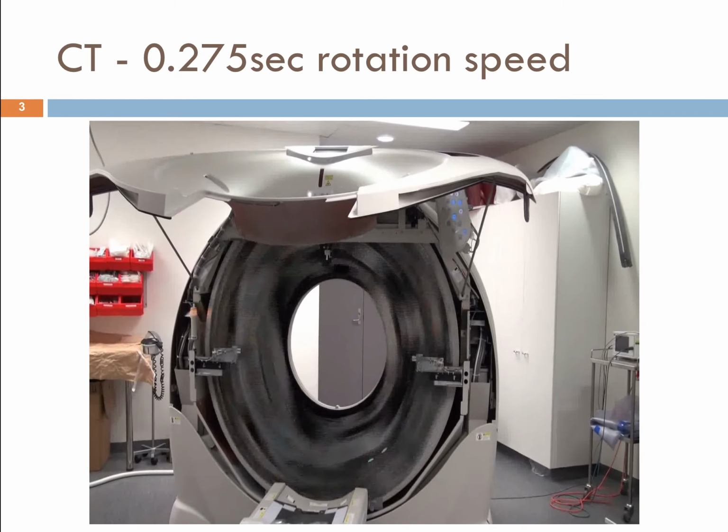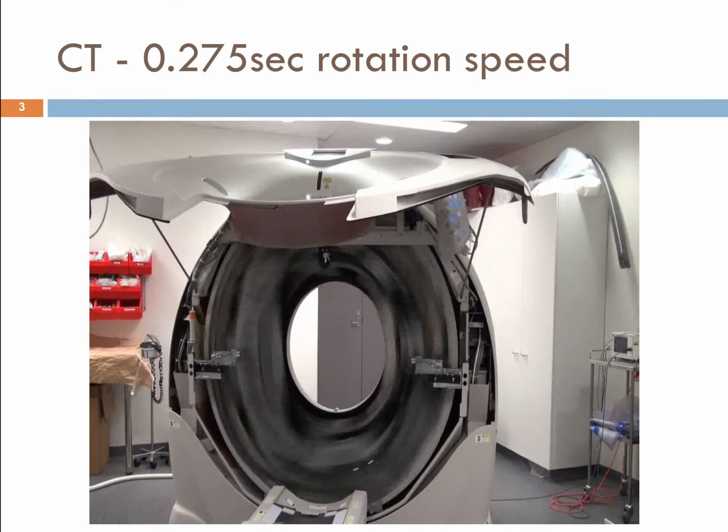Depending on how fast it rotates, it can generate around about 30 Gs of force. So these are generating enormous amounts of force, and I know you can't appreciate it from the image here, but they're quite noisy. There's a piece of paper at the bottom that's on the table. Luckily it didn't get sucked into the machine, or else I think all of us would be looking for new jobs.